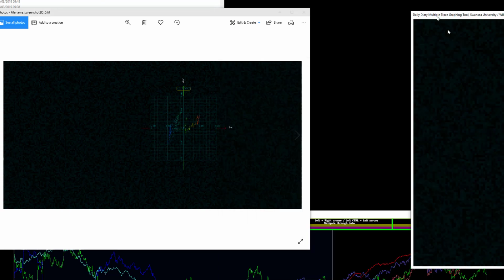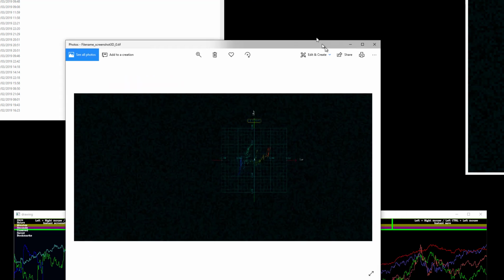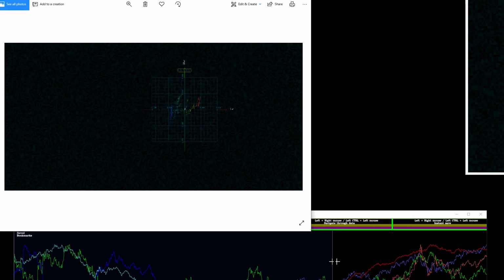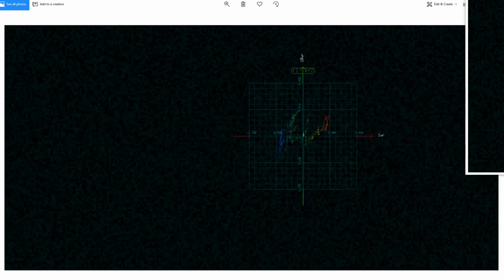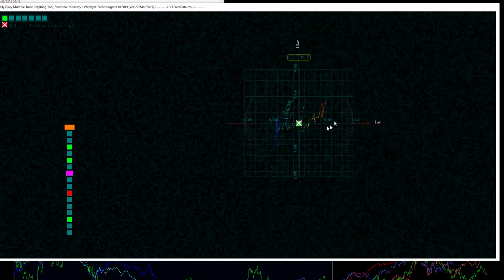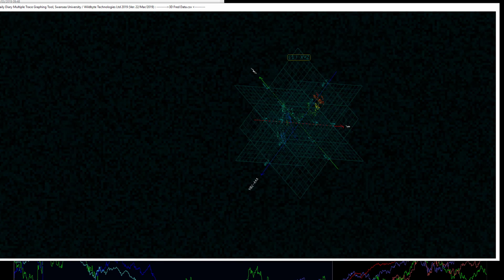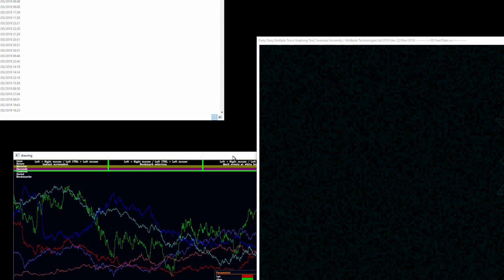So here we have, move it into your viewing area. So this is a screenshot that's been saved into your working directory, which is the desktop in my case. So yeah, there we have it. That's a bit of a 30-minute intro to the software.